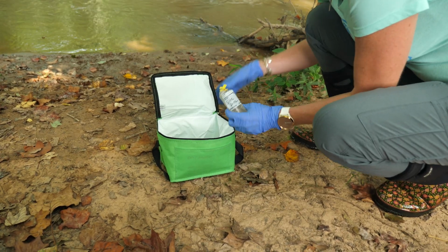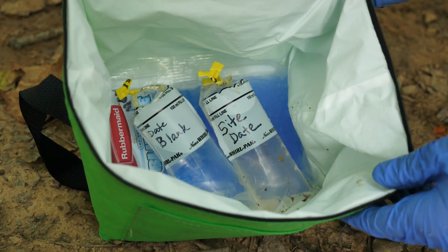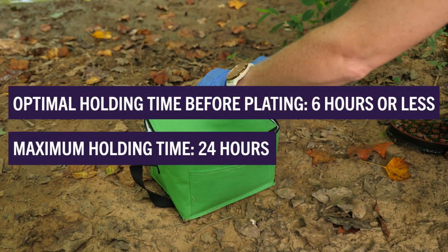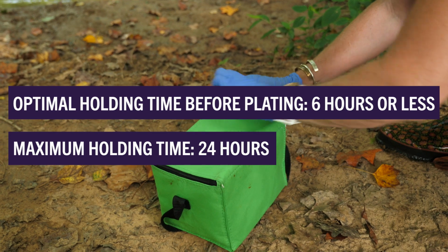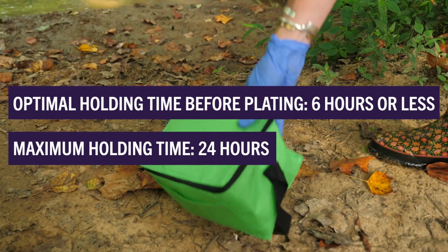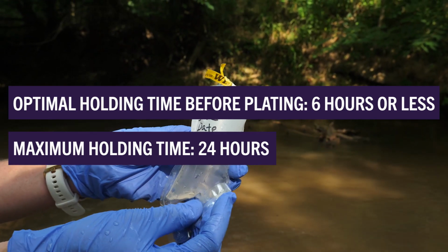Immediately place the stream sample into the disinfected cooler on ice. Allowing the sample to heat up or be exposed to UV light can alter the results. Optimal holding time for the water sample is less than 6 hours if it continues to be on ice or refrigerated prior to incubation. However, you have up to 24 hours to process the sample before it's no longer valid.